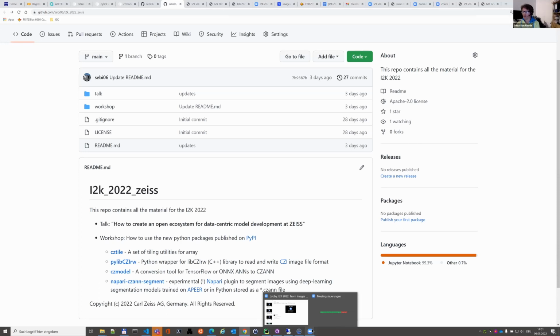So first of all, thanks for joining this workshop. And before we dive into details, maybe a few words about me. Maybe some of you know me already, others probably won't. My name is Sebastian. I work here in Germany, in Munich, for Zeiss Microscopy in our software department. I'm mainly responsible for our AI solutions, but also our CZI file format, which probably one or the other has to deal with all the time.